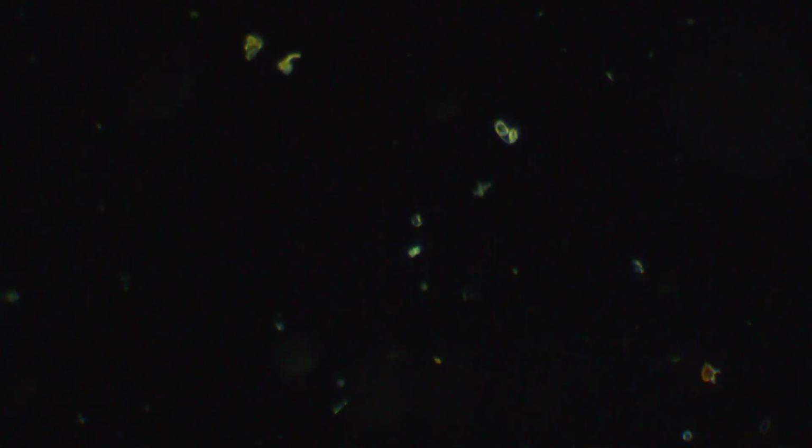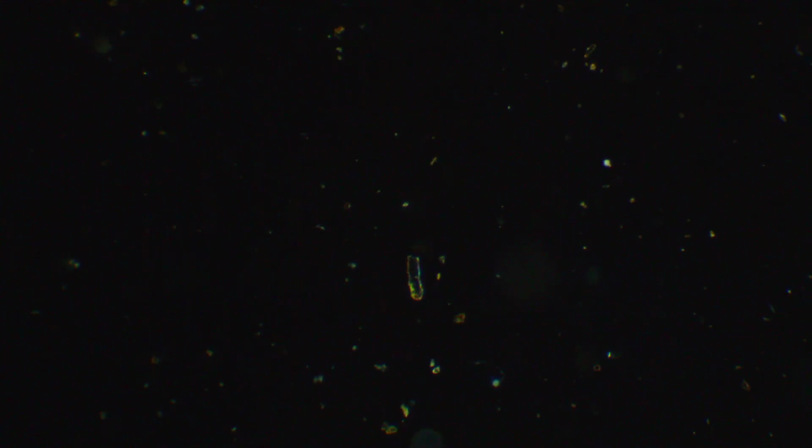See, this is interesting because, oh okay, I see him. There is a little guy connected to that, making it spin around. Little flea tick thing, doing a little dance. Let's go back out. That's kind of weird though. Okay.